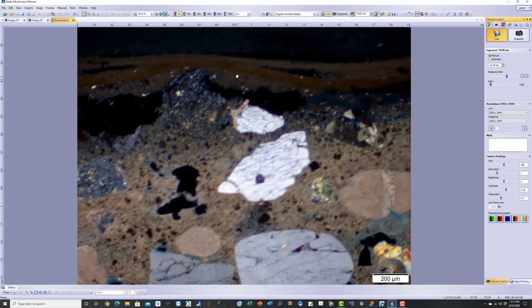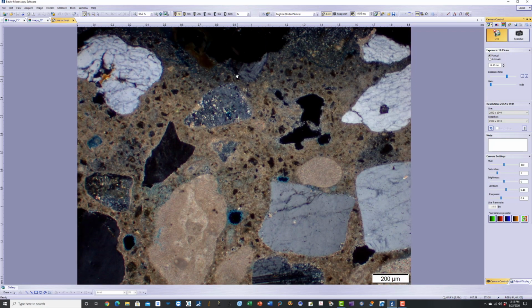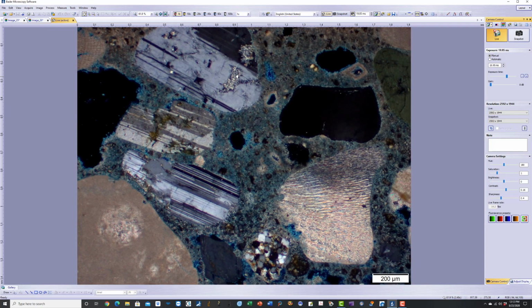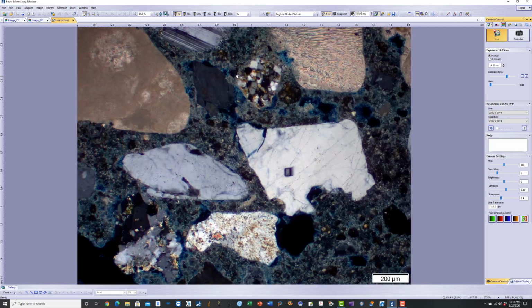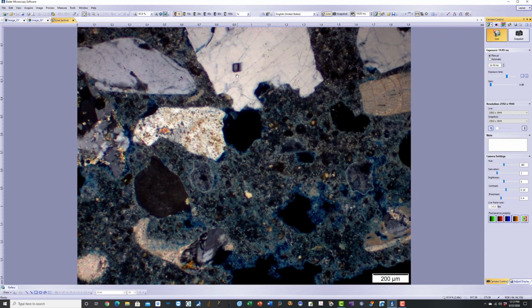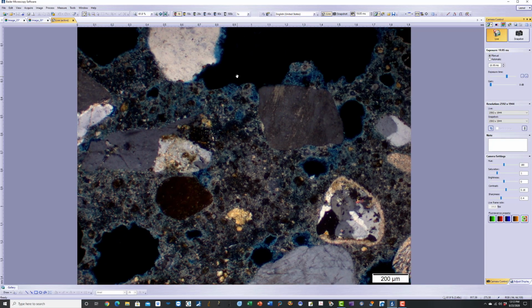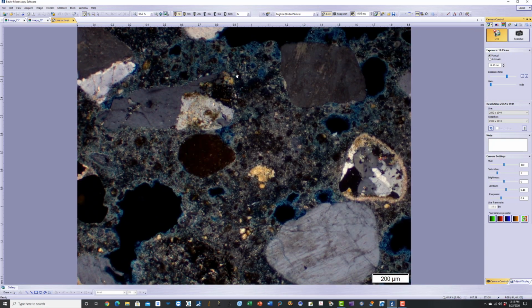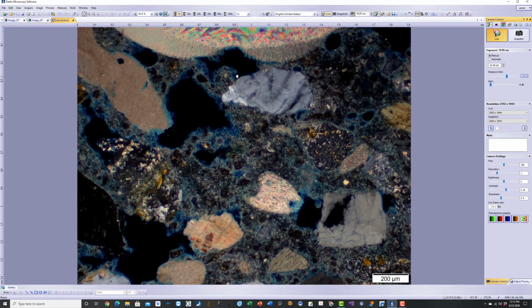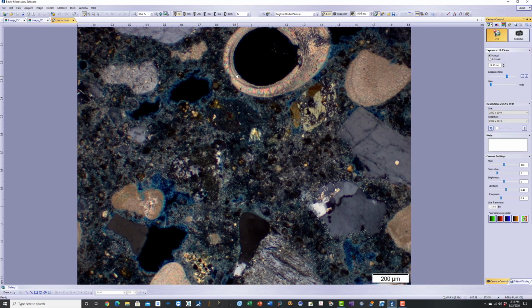So paint, then the dense exposed surface region of the mortar coating, then still carbonated but less dense interior portion of the mortar coating, where you have different degrees of carbonation. As you go deeper and deeper, the carbonation goes down and you get more pristine paste of the mortar coating. It's a straight Portland cement based mortar coating with a mixture of Portland cement, silica sand and seashells.